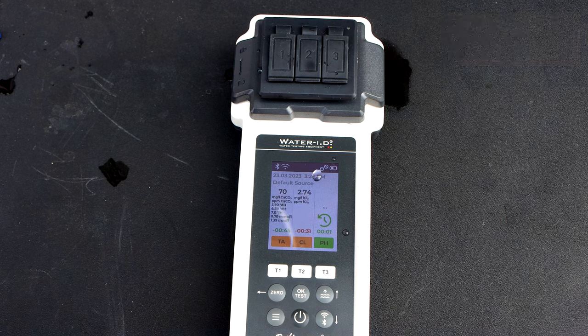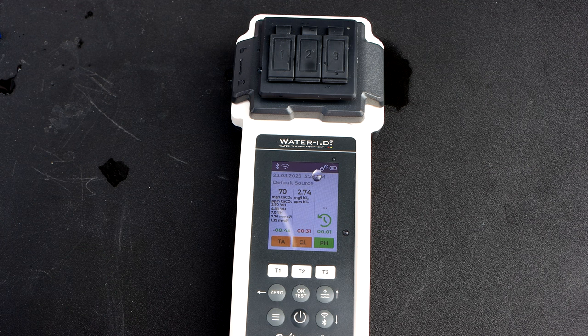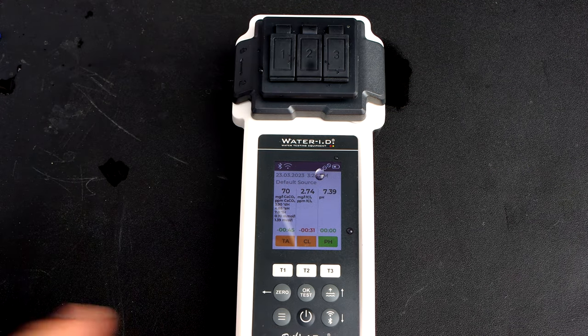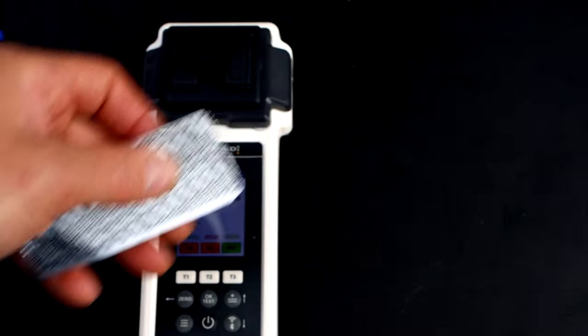The total alkalinity is 70, the chlorine is 2.7, and the pH is 7.39 or 7.4. So I'll do a total chlorine while I have the chlorine sample in the chamber. You want to use the DPD3.